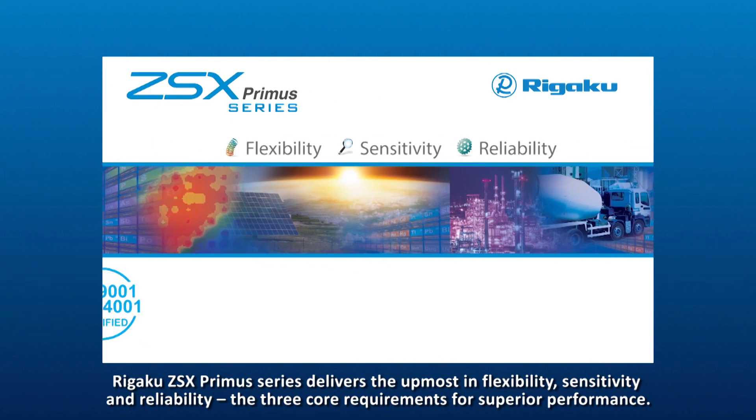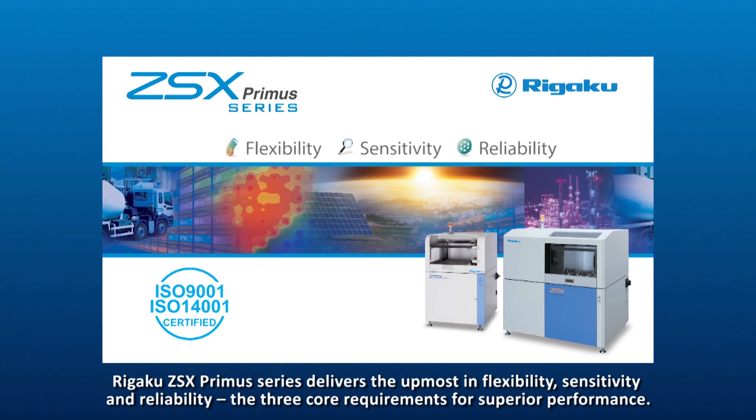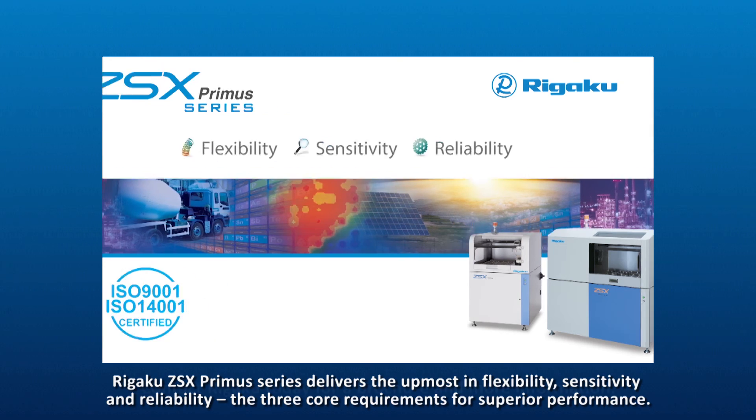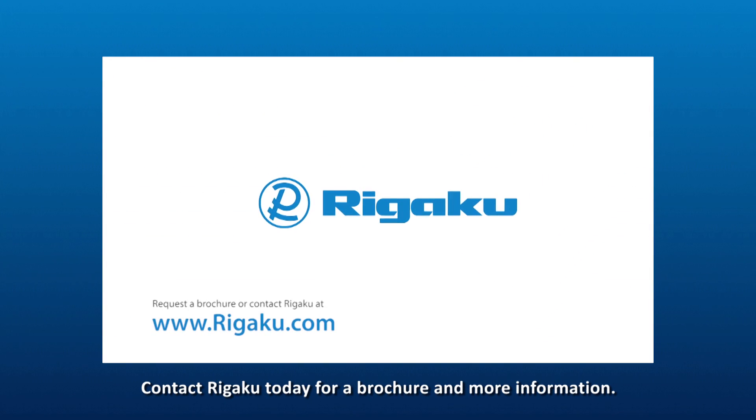Rigaku ZSX Primus series delivers the utmost in flexibility, sensitivity, and reliability — the three core requirements of superior performance. Contact Rigaku today for a brochure and more information.